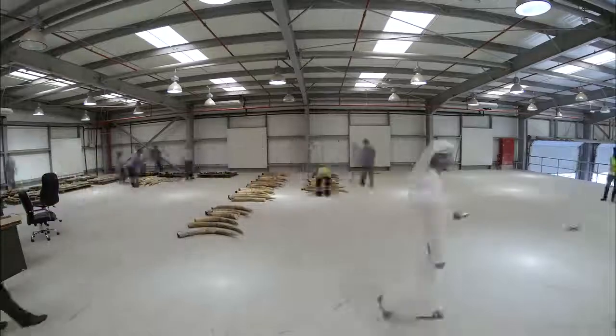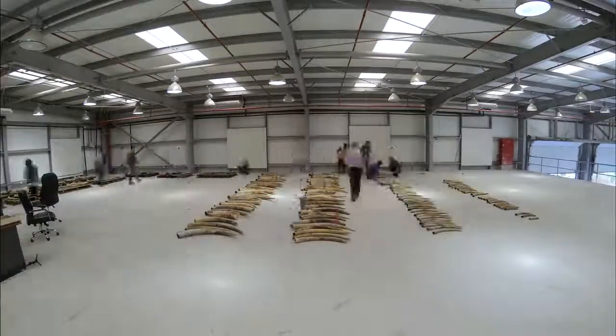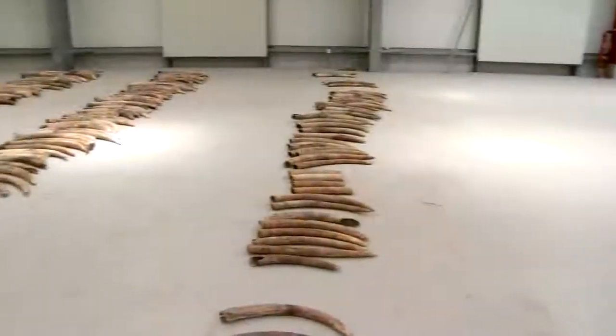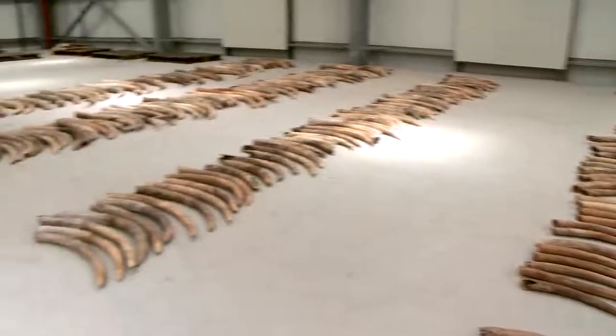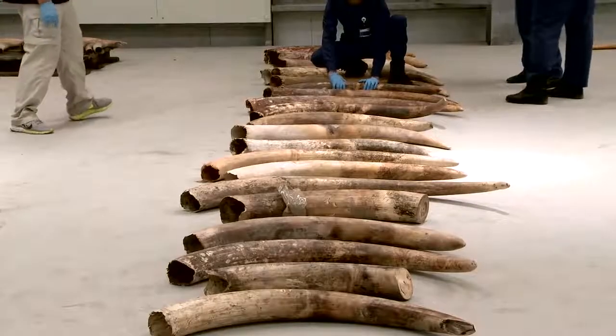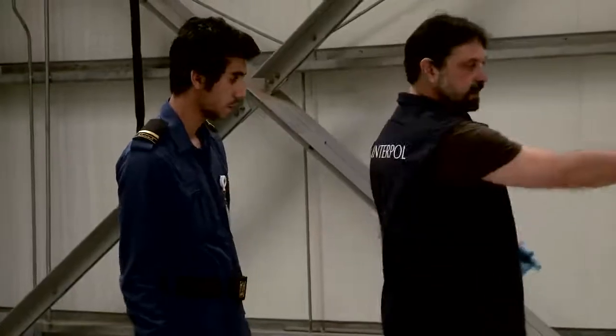Start by preparing an area that has enough space to lay out all the tusks and ivory pieces in the seizure. The work area should be cordoned off and secure. Make sure no unauthorized persons can access this area. Make sure it is protected, for example from rain, sun and wind. It should also be connected to an electricity supply for electric saws, lighting, etc.